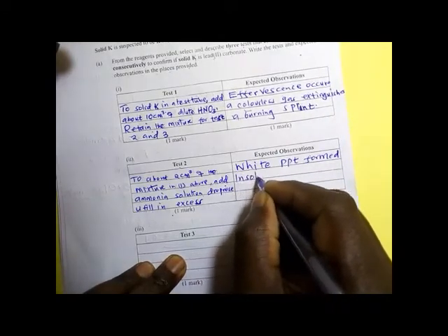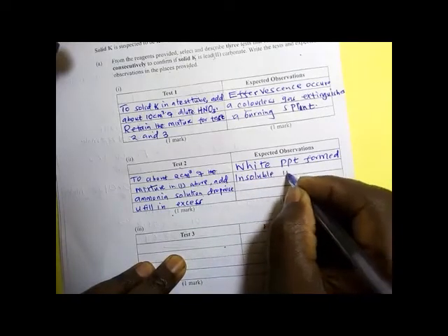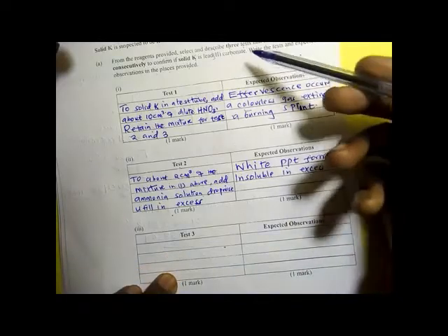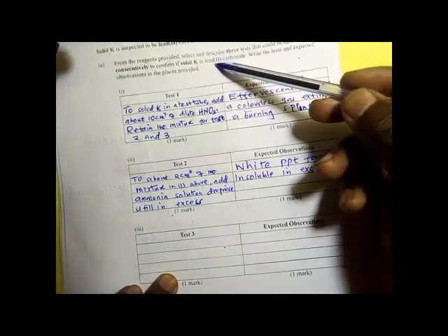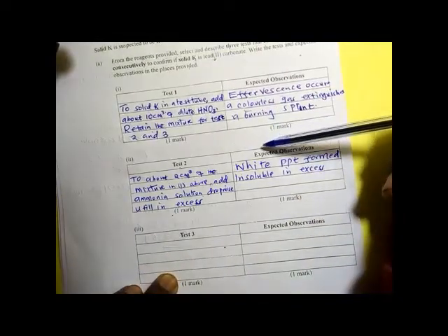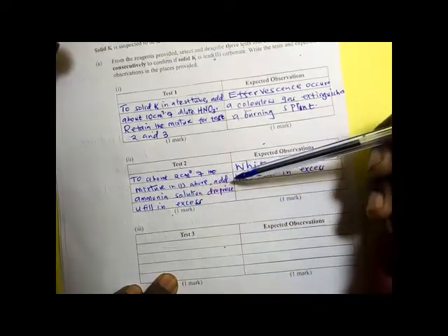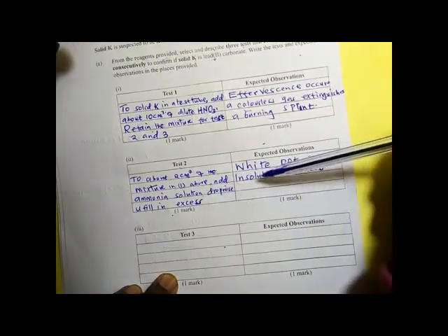If it was zinc, it will form a colorless solution in excess.